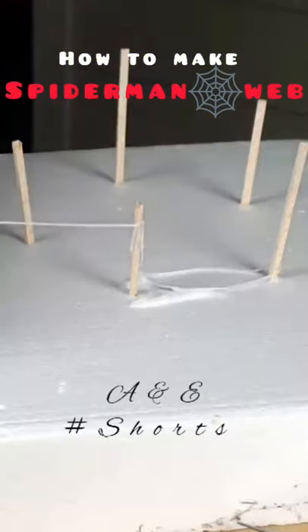This looks an awful lot like Spider-Man's web, so let's string it out and see how long of a rope we can get from these two liquids and see if I can make a spider web out of it. Yeah, it just keeps coming.